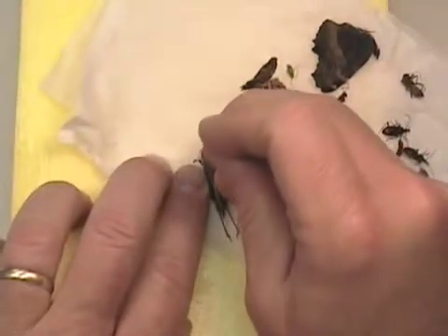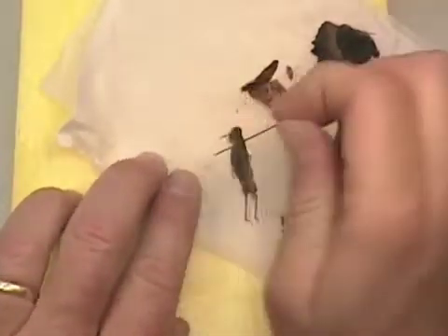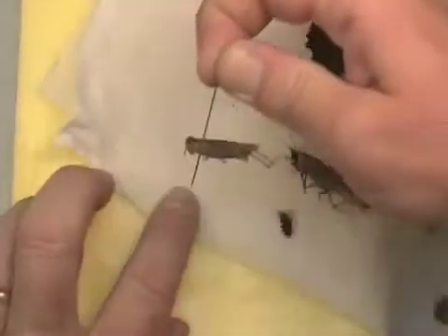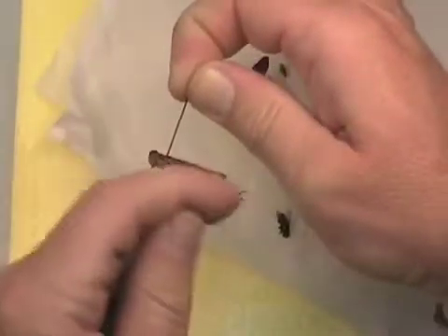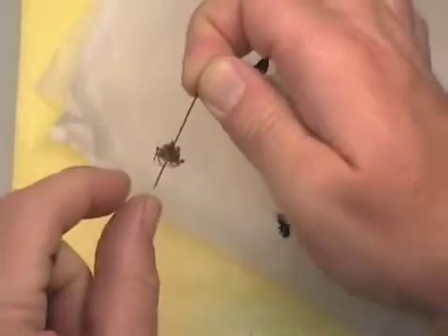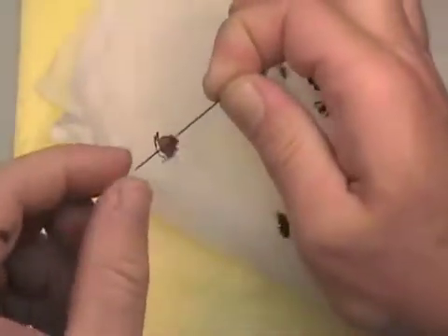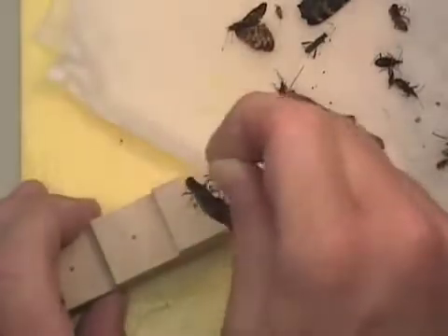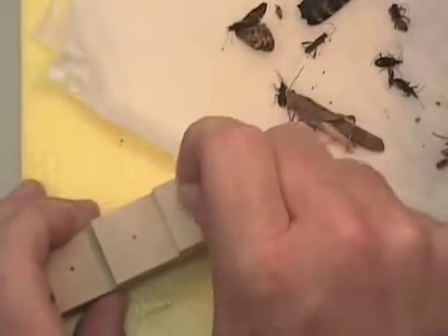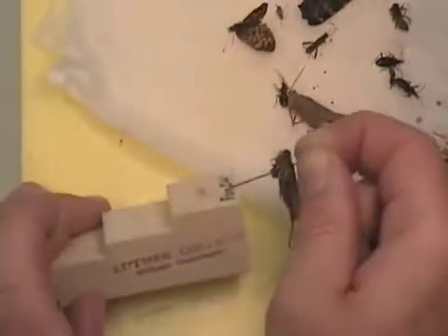We're going to put the pin just to the midline of the thorax. The important thing is that you put the pin in straight so that the body is perpendicular to the pin, and also that the body is not tilted to the right or the left. We then will take the pinning block and put the insect at the correct height on the pin using the tallest level.